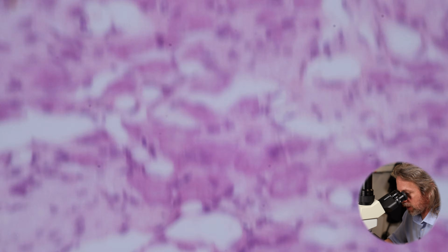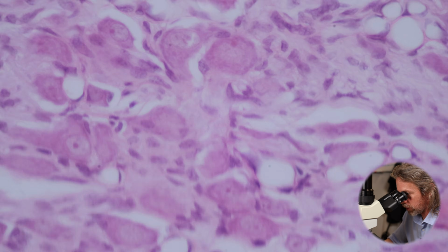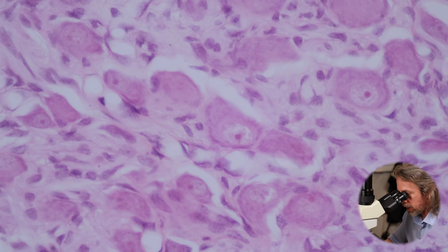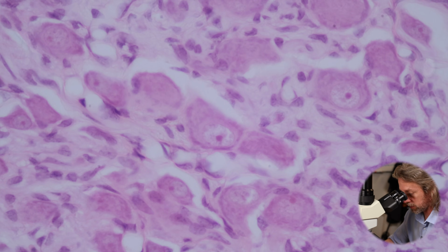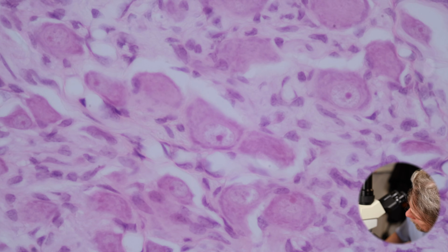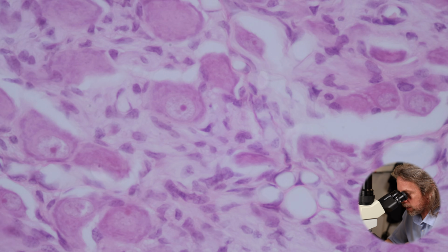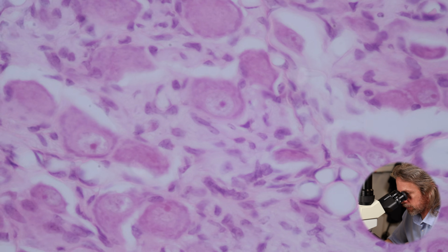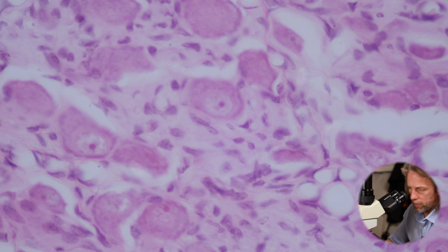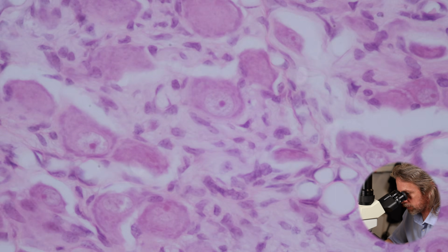So inside the cell itself, it looks quite granular because neurons are quite active, they're quite busy, they have quite a lot of work to do. But that is the neuron cell body. So it's quite big. It's a lot bigger than the axon. I'm at 400 times magnification here. If we're lucky, we might be able to see some dendrites, but there's a couple of good neurons there.